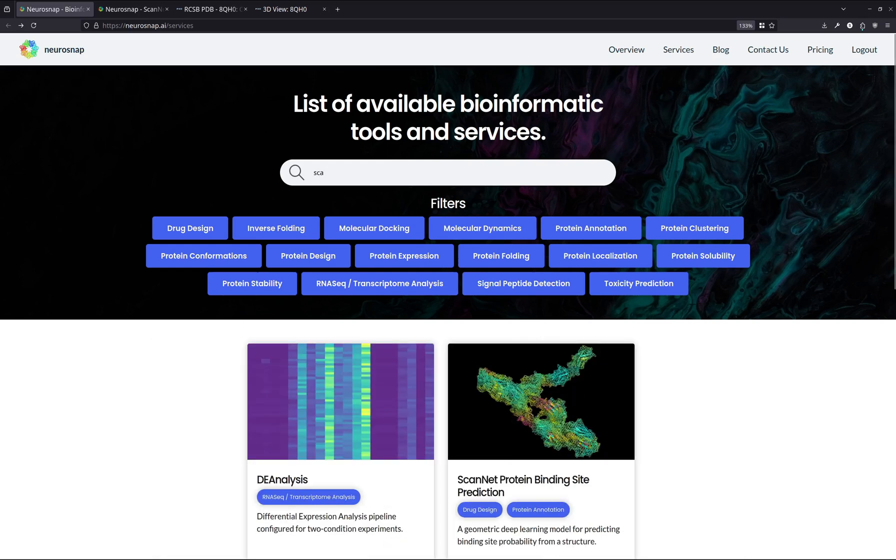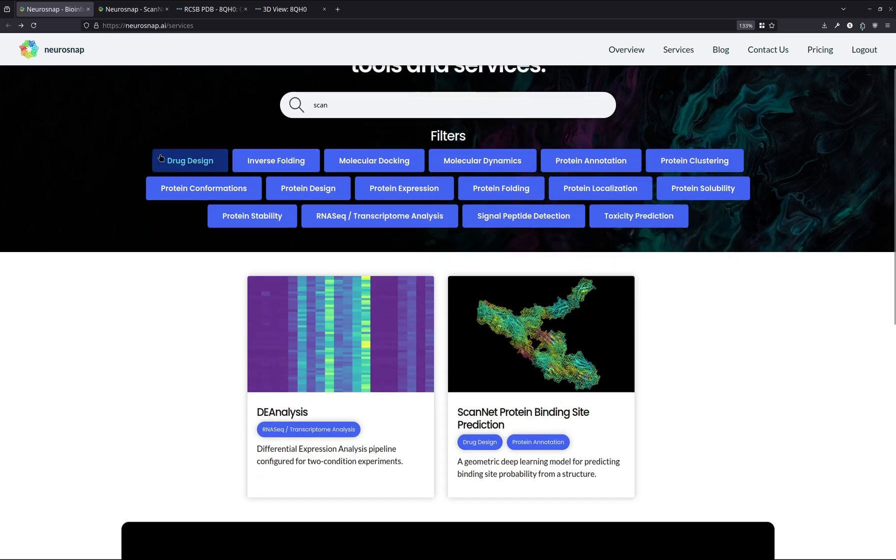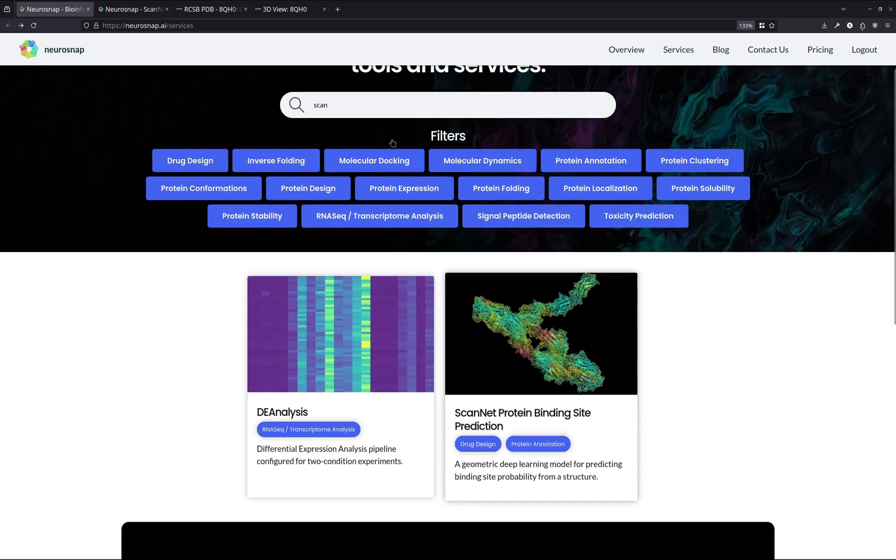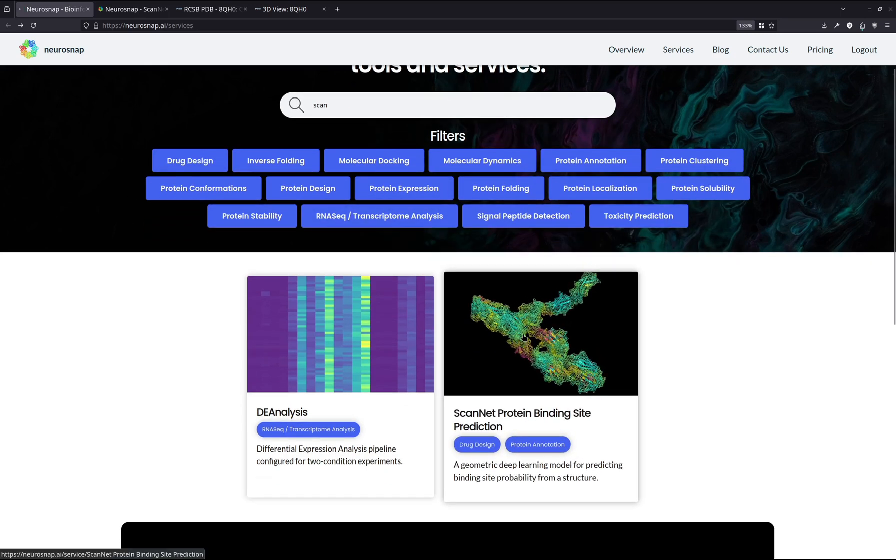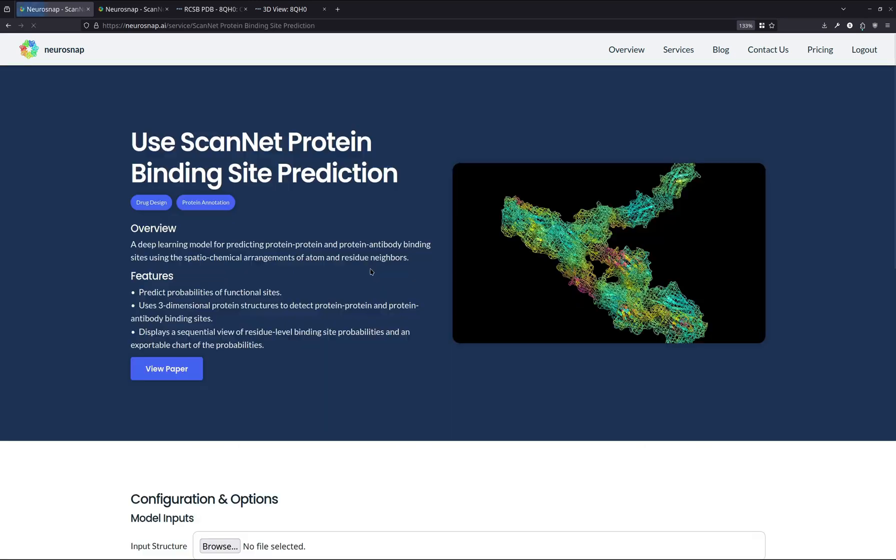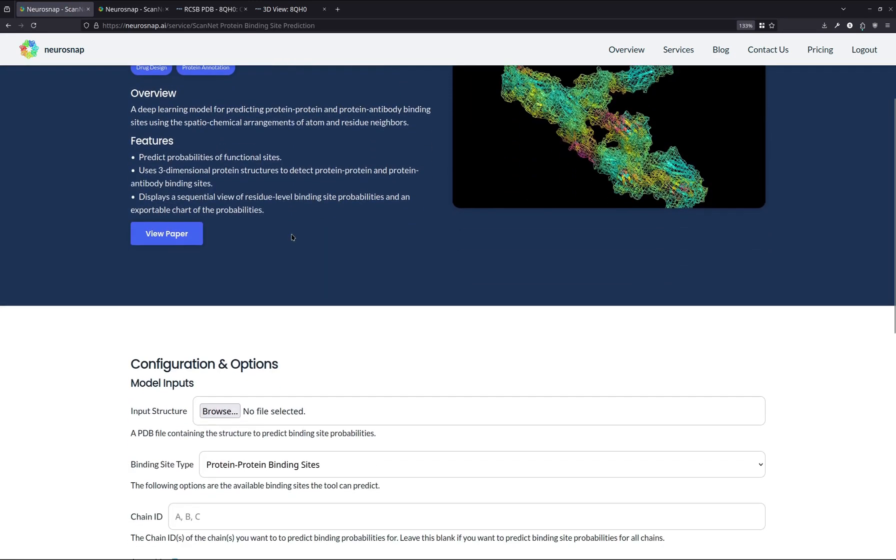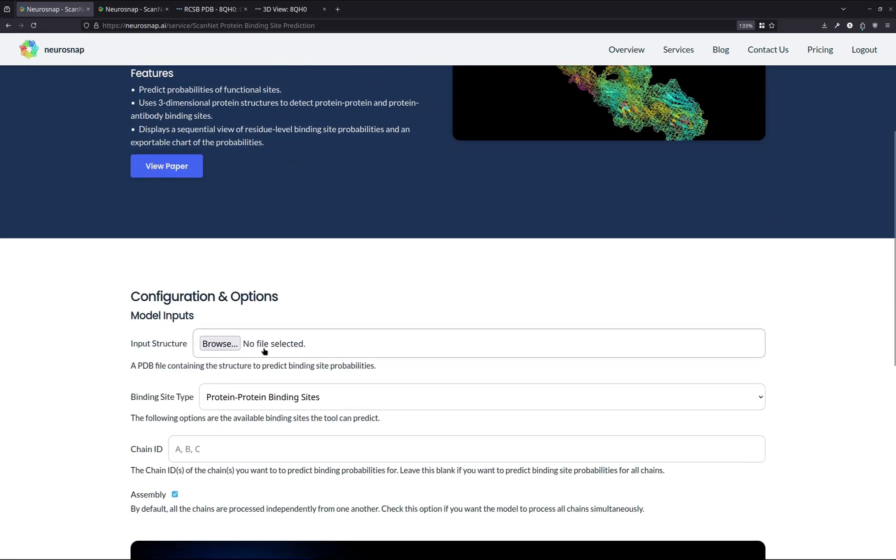For ScanNet, what you want to do is essentially just access the tool by searching it over here in the search bar, scrolling through, and now that we've selected the tool, what we'll do is we'll have to configure things to meet the requirements of our experiment.